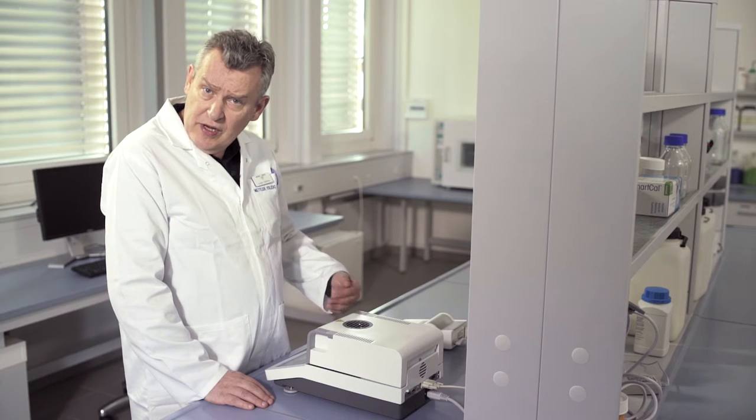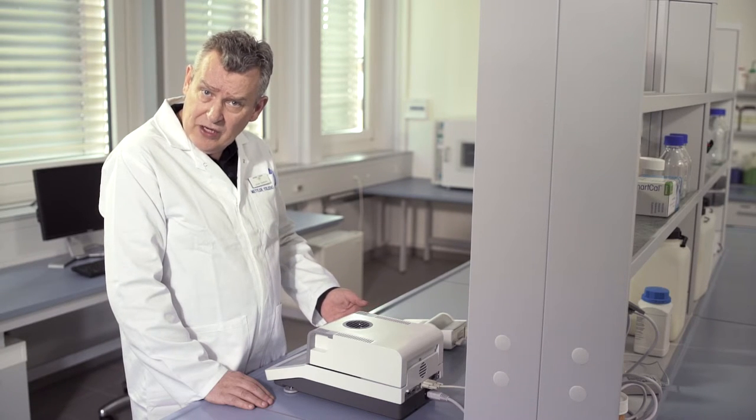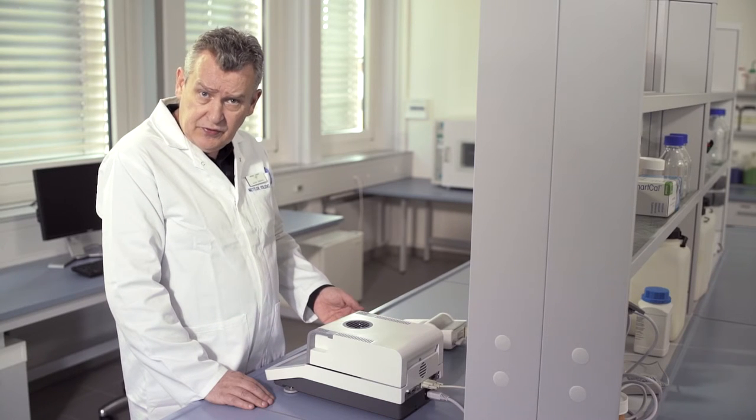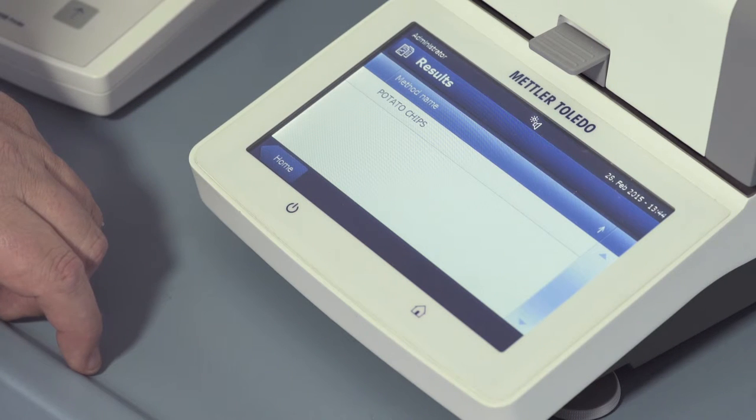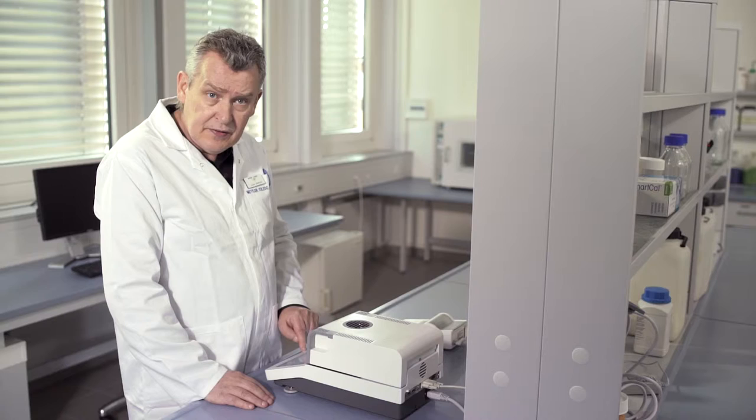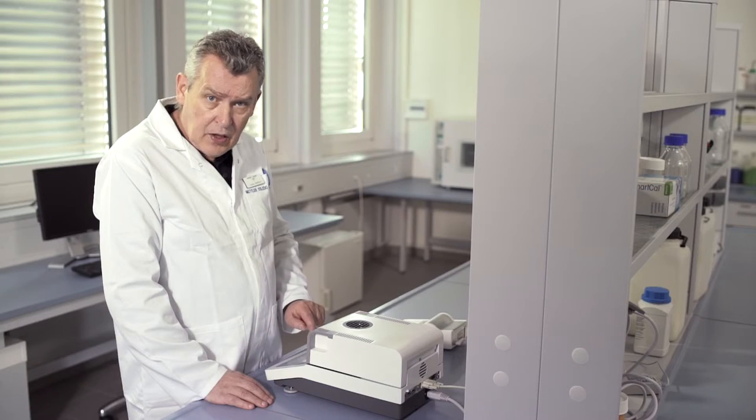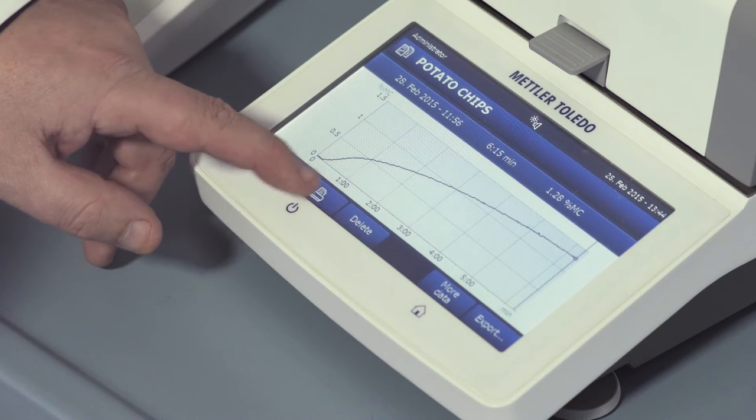If you want to print a result, you can either define automatic print after the measurement, or you can even print an old measurement result by navigating to results, select the method or sample of interest, and then the actual result. Now press the print icon, and the result will be printed.